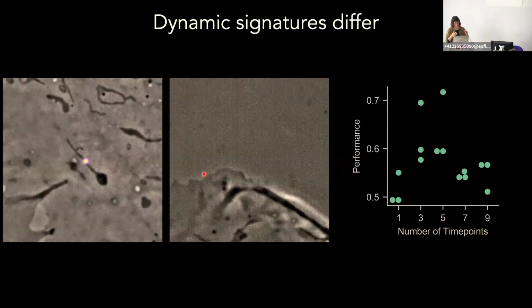One way is that we are taking in multiple frames as inputs simultaneously as multiple channels. And we've looked at the influence of the number of time frames that we include as inputs simultaneously on the detection efficiency. We've also included a long short-term memory module at the bottleneck of the detection network. And this is what is really giving us a boost in performance.